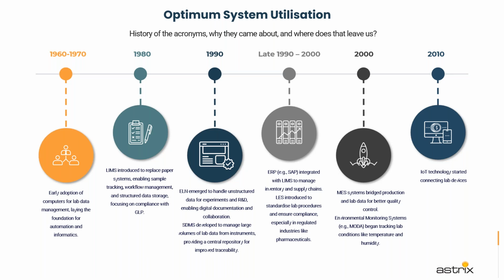That is, the LIMS companies would try and add some light experiment style functionality, which usually resembled some kind of spreadsheet. And that was to try and steal market share from some of the ELN folks. And the ELN folks would add some light sample tracking functionality to try and do the same.